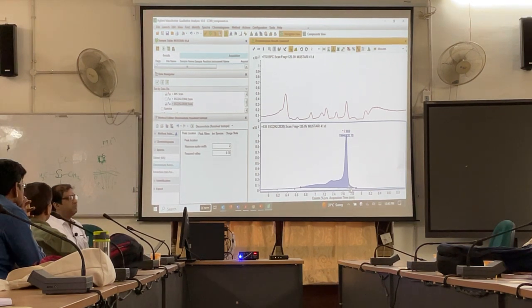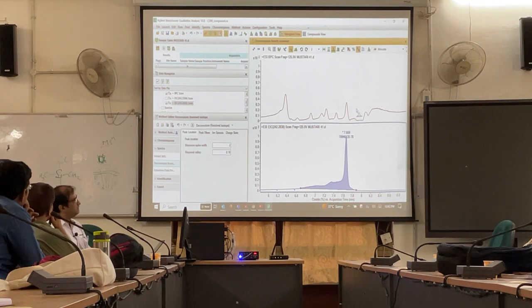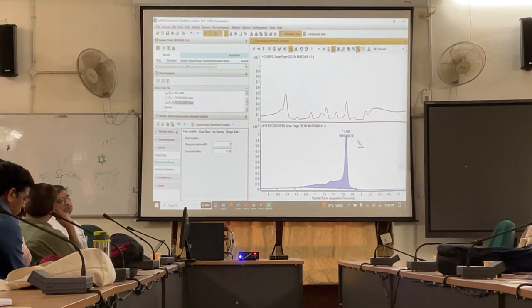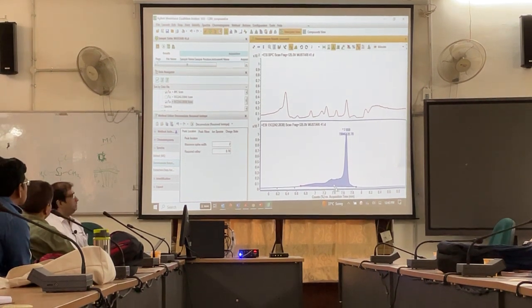Tomorrow there is a session from Dr. Sanjeev Kanodia, so he will show you. If I have another sample where this area is varying, then I will know that the abundance is varying. Okay? So this calculation is based on the EIC only.